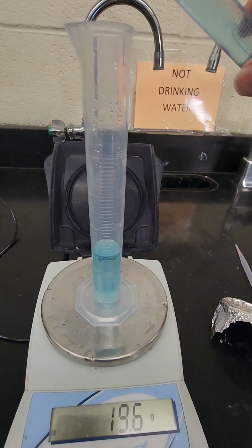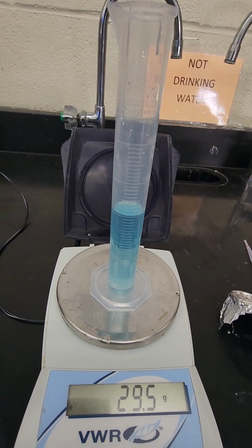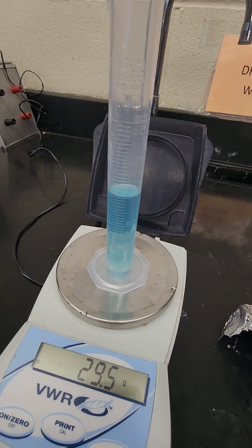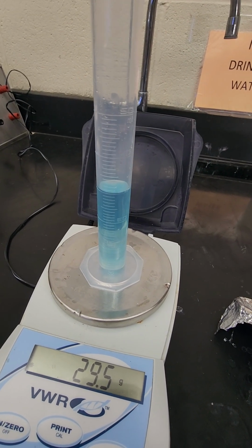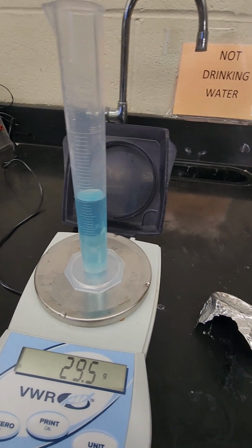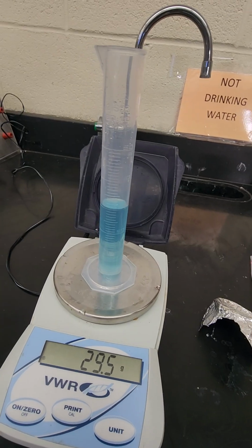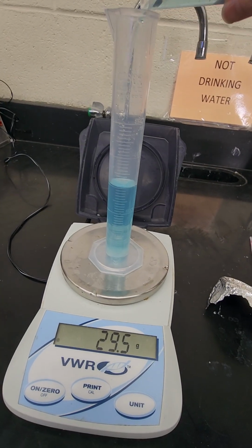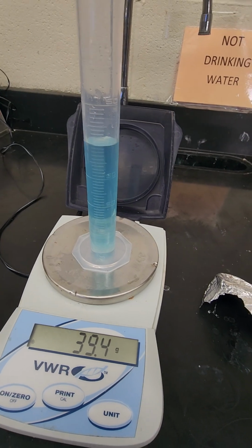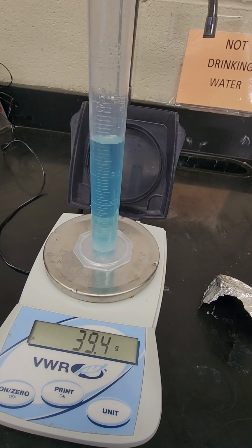Now I'm going to pour 10 more in for a total of 30 milliliters, and the mass now is 29.5. Again, writing this down into the data table. What you don't see is I'm doing the other one with my right hand. Okay, and this is a total of 40 milliliters. Now the mass is 39.4, so I'm going to write that down into the data table.